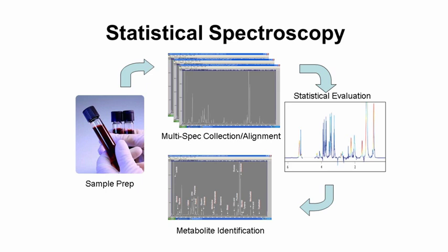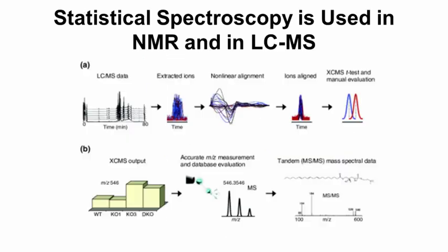And here they're colored in orange or yellow. So what might have begun as a spectrum with 1,000 peaks, we're now reducing it to a spectrum of 3 or 4 relevant peaks or regions. And if we focused on those ones, then we can now focus all of our efforts on identifying those significant peaks and what compounds they are. So it defers the compound identification task, and to some extent it can simplify the compound identification task. And in many cases, this approach is widely used in LCMS and even GCMS.